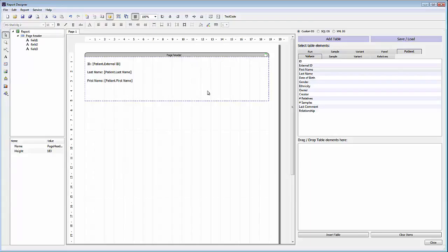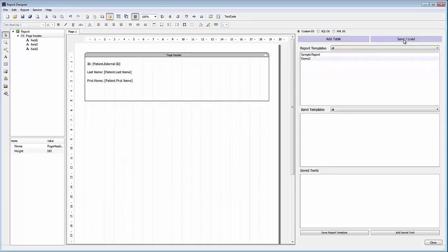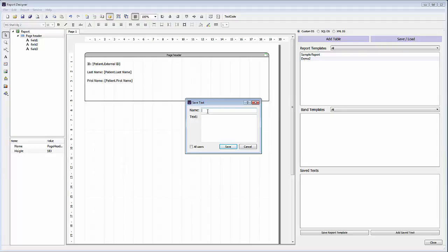Next, on the right side of this page header we're going to add some laboratory information. At this point I'm going to switch to a different view on the right side. If you click on the save/load option, you have different options for saving the full report template, a band template which would be just a part of the overall report, and you can also save individual text fields. So if there's information that may be used in multiple report templates, you can save a text for that information. We'll do that for our laboratory information. To create a saved text, click add saved text, create a name — we'll call this lab address — and then type in the information to be included. You could also copy and paste this information in.